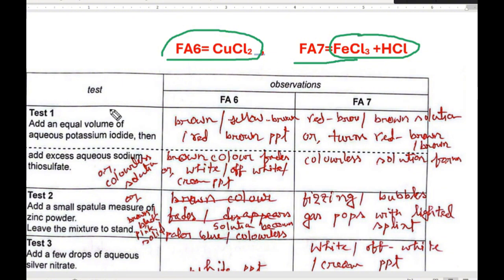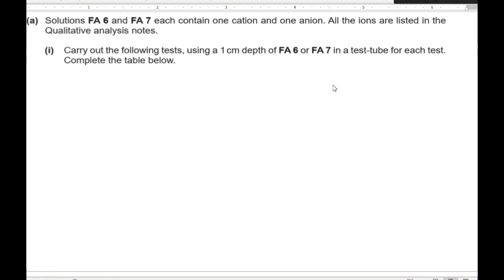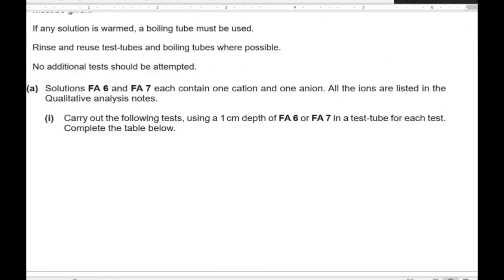So first, test 1, you see, add an equal volume of aqueous potassium iodide.